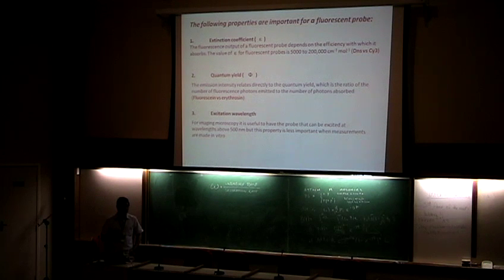So when you are talking about fluorescence, a lot of people use fluorescence just to get the data. Because it's such a good tool, very fast, it is also a good source of bad data sometimes, so of artifacts. So one has to be very careful with artifacts and other competing effects that are occurring. You have the Raman line, there are many possibilities, and if you're not careful, you can get these artifacts. So especially now when you are transferring what we know from fluorescence in solution to the microscope, if you are trying to get information in the cell, that might be very dangerous. So you have to be careful and pay attention to all that.